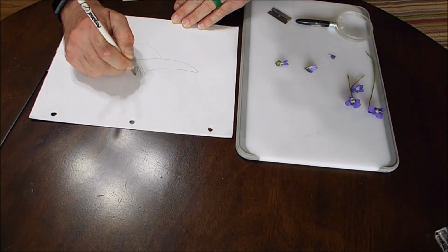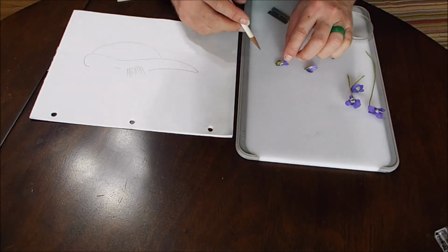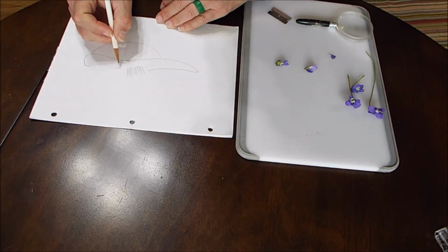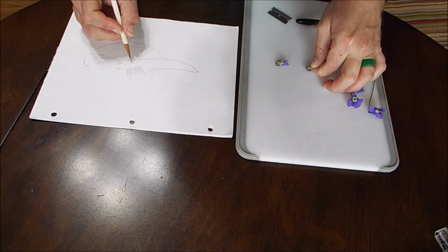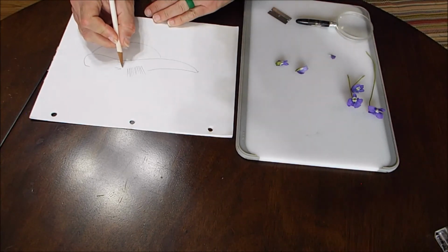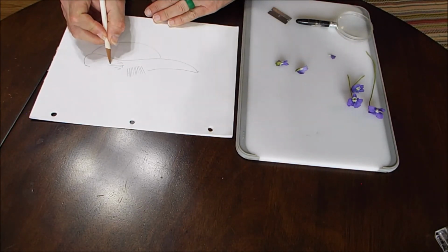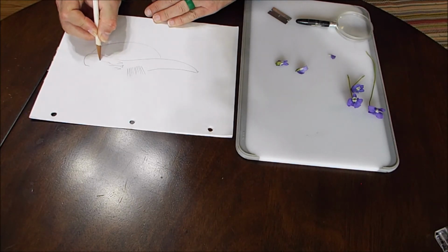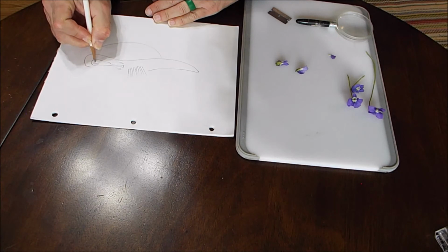And here we have all those little fuzzy stamens, alright? And then right here is where the carpel begins, and there's these little orange bracts that really don't do anything, but they form a boundary around the top of the carpel. And the stigma sticks out here, and there's the style, and then it goes back to form the ovary, and then inside the ovary, if you're really lucky, you'll see ovules.